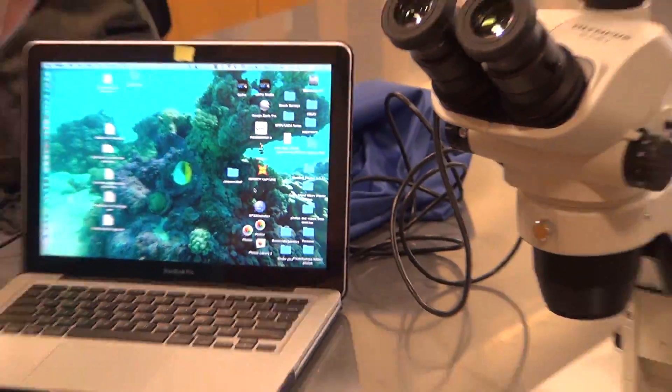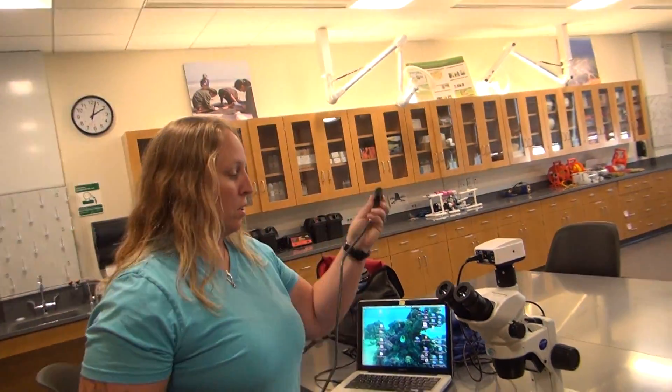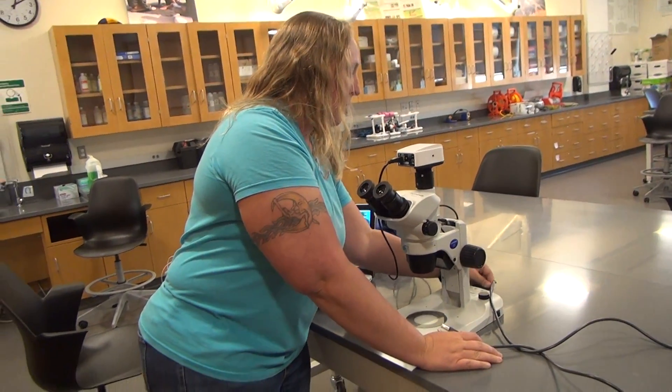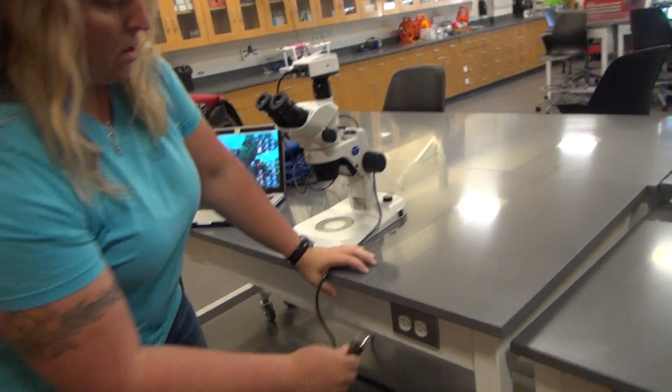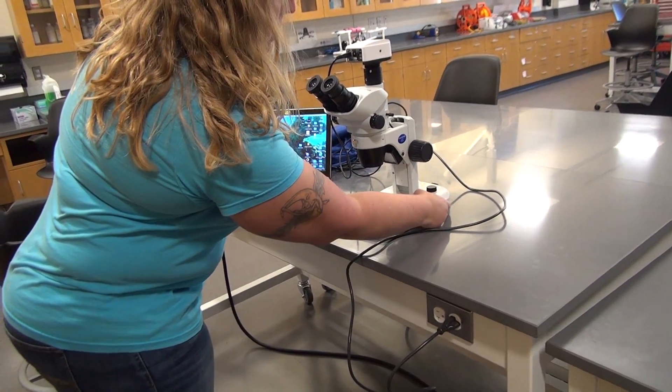Your power cord, like any other power cord, has a shaped male part that goes into the shaped female port. Make sure you put it in the right way, or you will break it. Plug your microscope in. The power switch is on the side here.